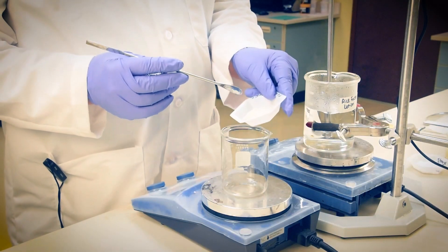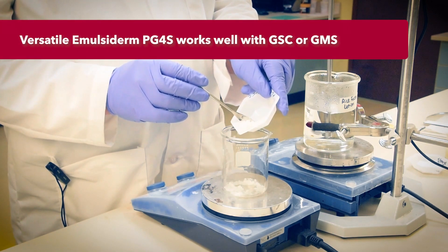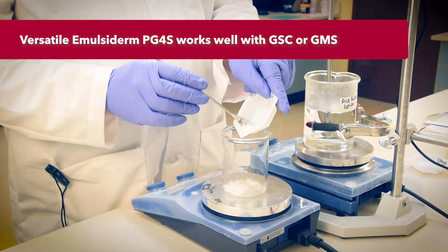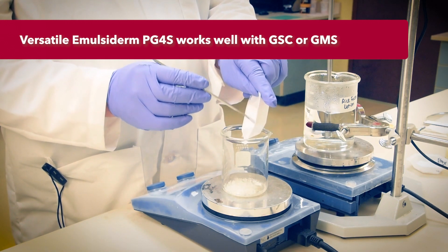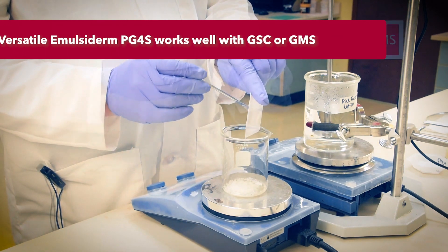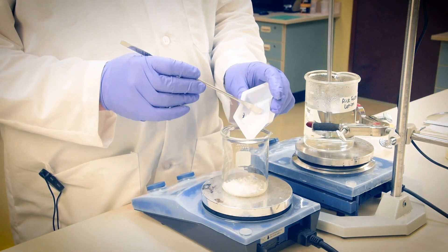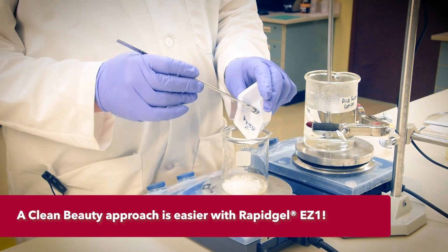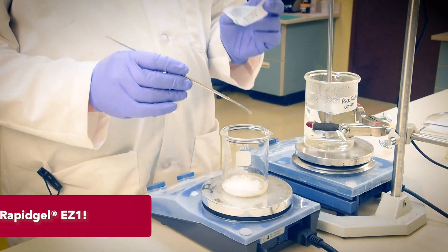In a separate vessel, we'll combine and heat the elements of our dispersed oil phase, phase B. We'll weigh and add our emulsifiers first — glycerol esters, Emulsiderm PG4S, and glycerol stearate citrate at a ratio of 3 to 1. We've found this to be a versatile oil and water emulsifying system. We'll now add small amounts of builder Cetearyl alcohol and Cetyl palmitate. Rapidgel EZ1 will associate with these, building viscosity, so we can keep it clean here and use only a little of both.